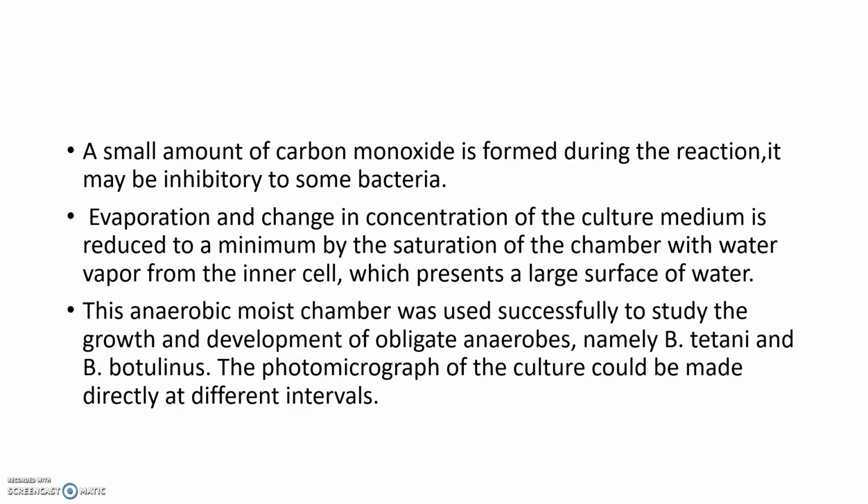The anaerobic chamber was used successfully to bring about the growth and development of obligate anaerobes, namely Clostridium tetani and Clostridium botulinum.